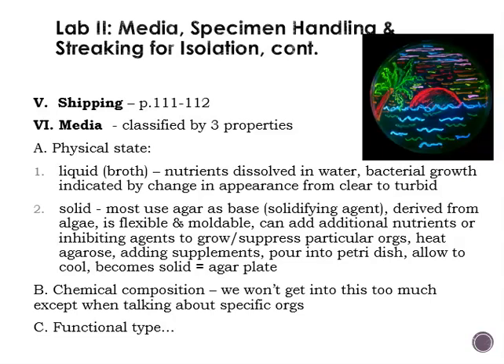And bacterial growth is indicated by change in appearance from clear to turbid. So if the liquid broth media started out clear, we inoculated it with a wound culture swab, and then it incubates overnight, we come back the next day, and it's turbid or cloudy, then that means that the bacteria has grown in that media. Solid media, so we have to use an agar base.